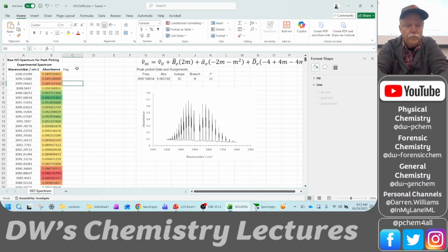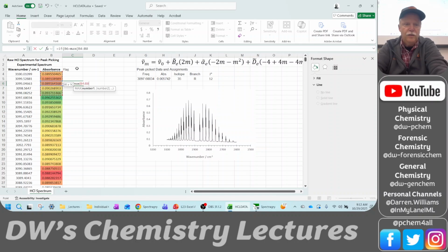So equals IF, open parenthesis, if this cell value is equal to the max of this nearest 5 points. You see what I'm doing here? I'm trying to find the maximum in a range of 5 points. Then I'm going to return a flag of 1.